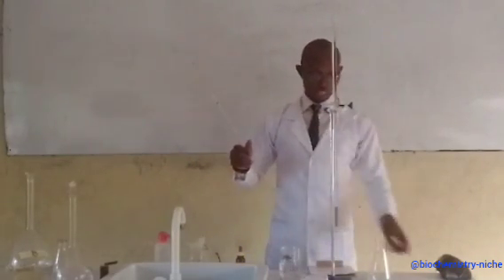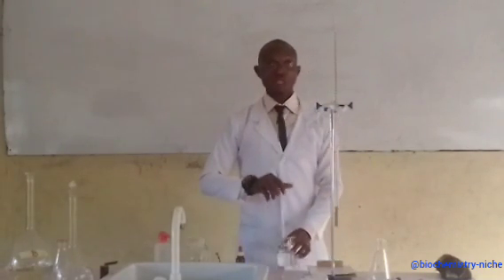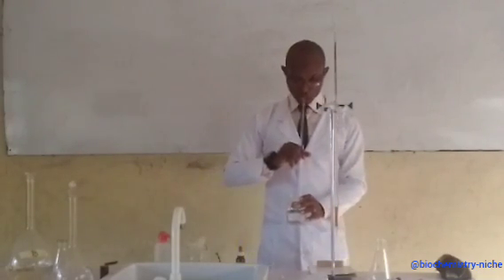Make sure you remove your funnel from the tip of the burette. It is very, very important. Leaving your funnel there could add more to the substance in the burette. So this is my base now.